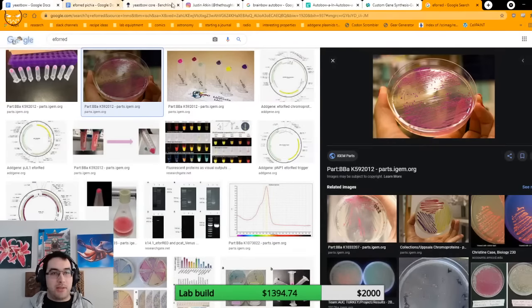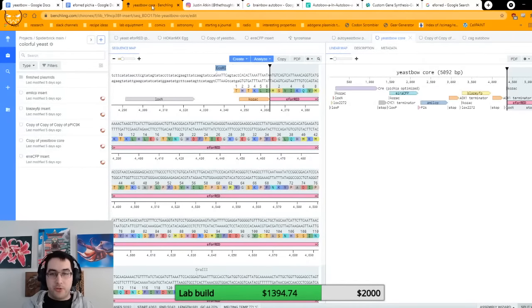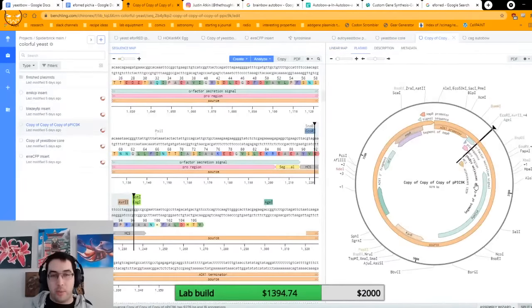Okay, so anyways, back to the thing. As part of the race, we're in 1 liter. We've got to see how much protein we can make. And we have to make the identical protein, so like amino for amino, they have to be the same. But other than that, there's no real rules. So basically, I made sure that this just slots right into the backbone, so that way it's the easiest. Just cut it out, stick it into the new thing, we're done. For all of the other ones, though, you run into a bit of a problem, because it's just not going to fit.